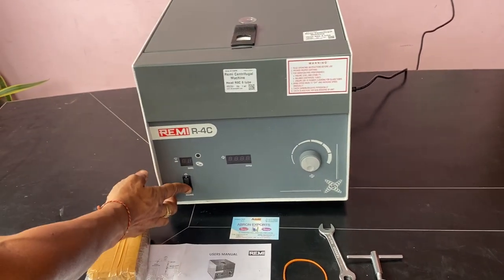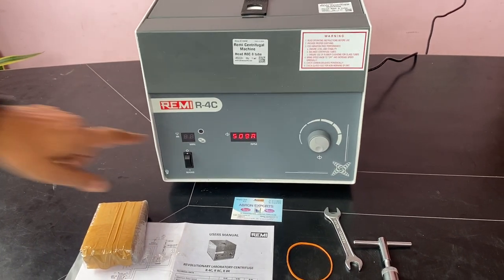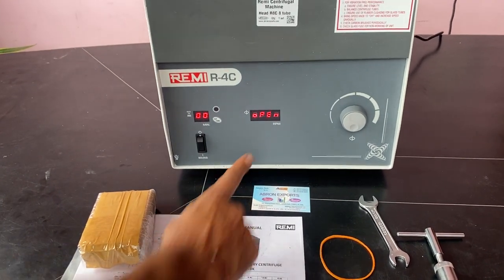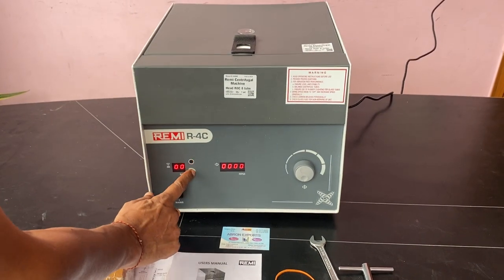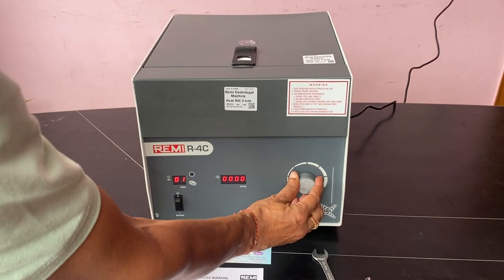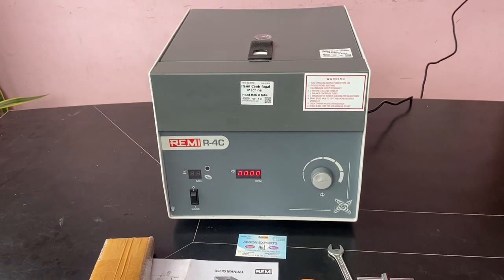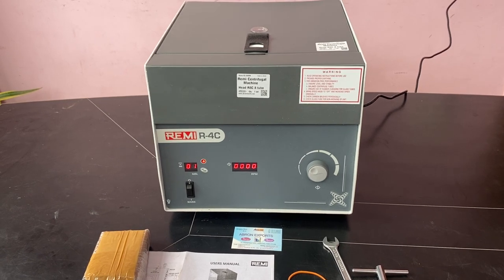Close it and switch on. Now I'll tell you the working — very easy. When the lid is open, it will tell you the lid is open or closed: 'Lid open.' And when it is closed, you can change the minutes to one. Increase the RPM and it will start working. Very easy to use.